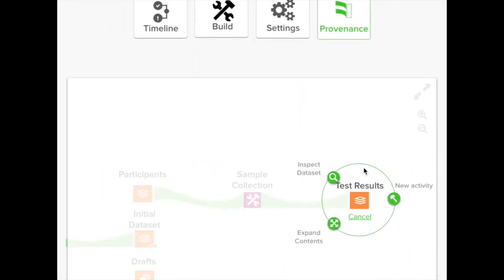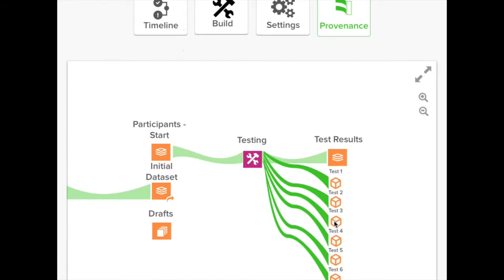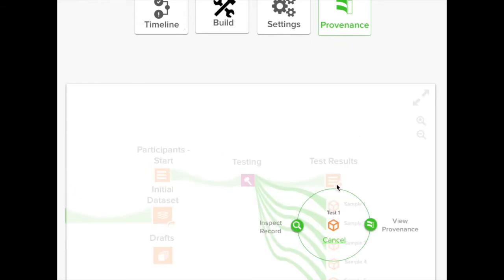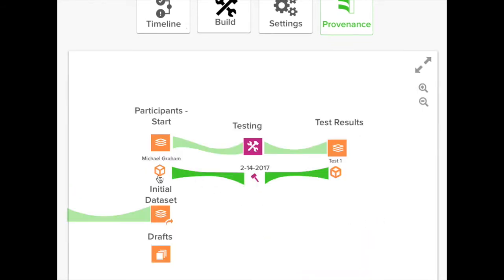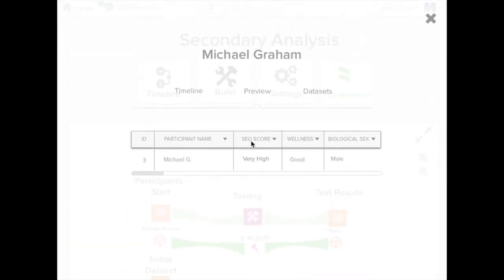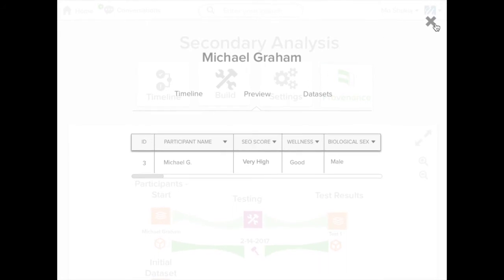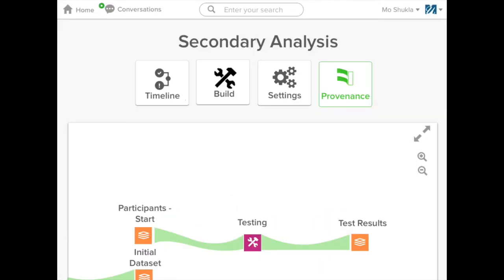Our unique provenance graph connects all your activities into a single comprehensive story, and you can instantly see every input and output all the way to the beginning of the project.